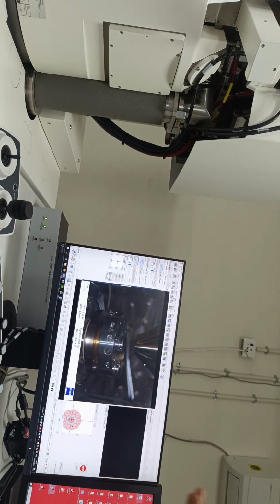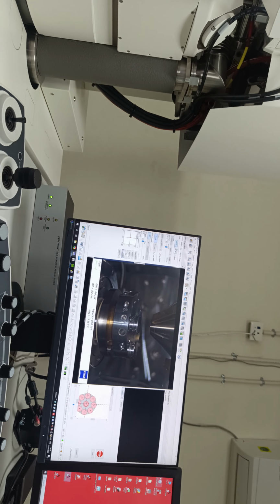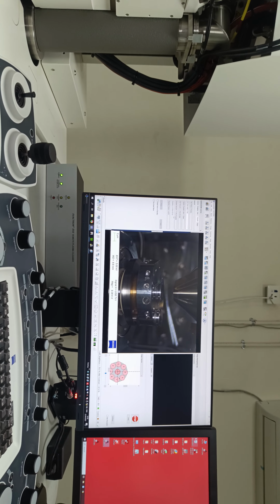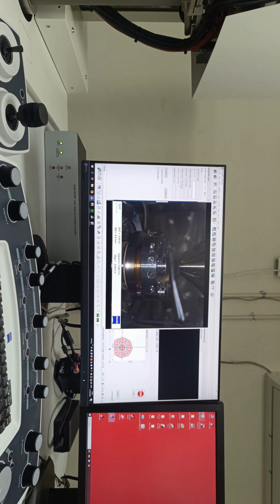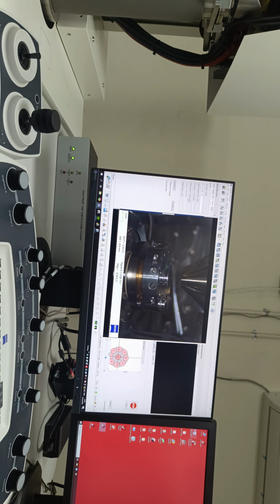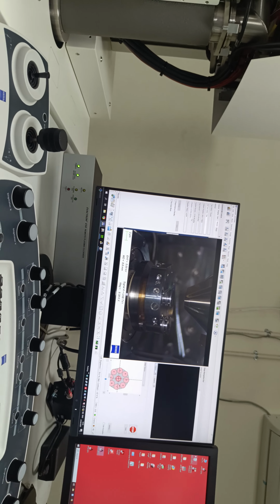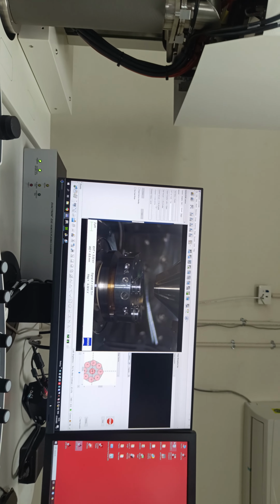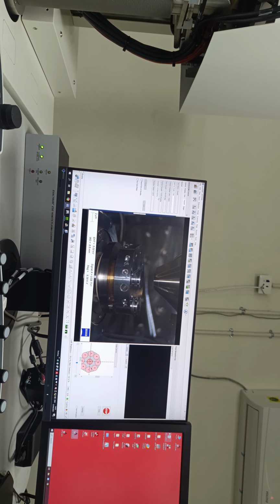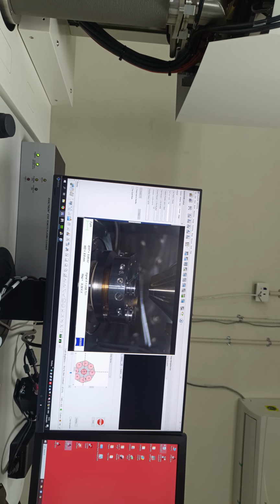The vacuum level we are seeing here is the system vacuum, which is nothing but the chamber vacuum. Now it will show us 10 up to 60 Pascal: 10, 11, 12, with a step size of 1 Pascal that we can change. And for that particular VP mode, we can use our VPAC.